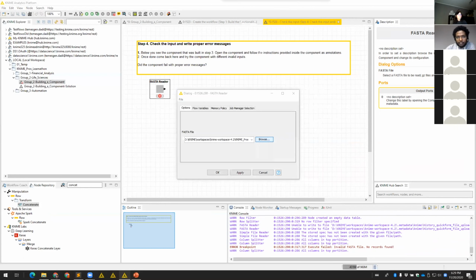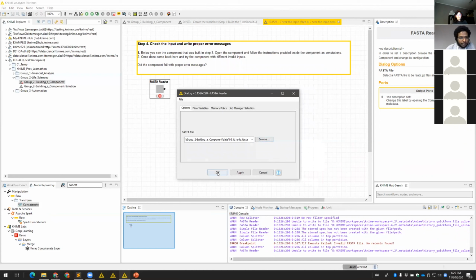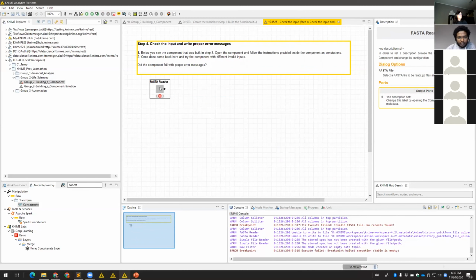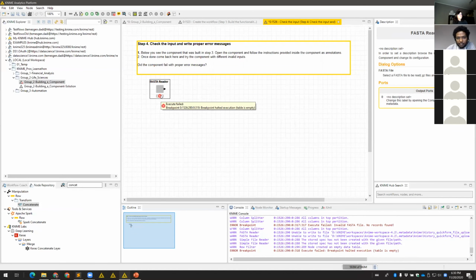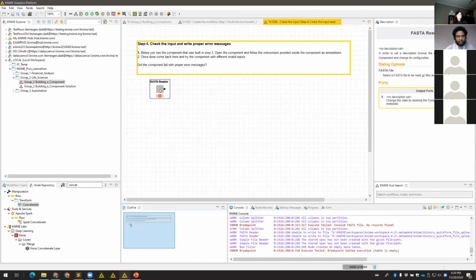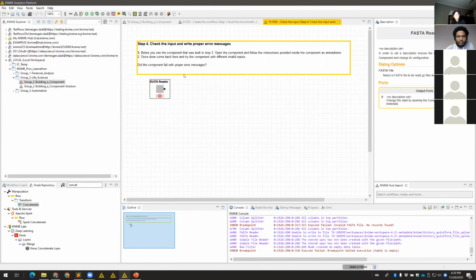And if we change to only ID FASTA files, it probably would make sense to show how these FASTA files look, but you can see them, they are part of the workflow. We have an error message telling us the table is empty. I think we didn't get the error message set up quite right, but you get the idea.